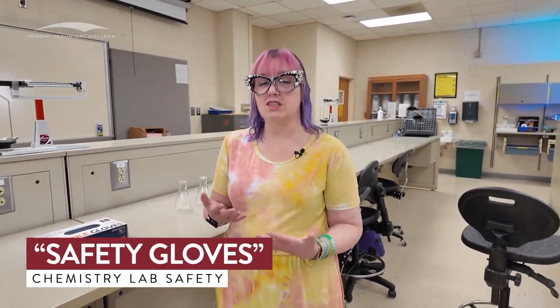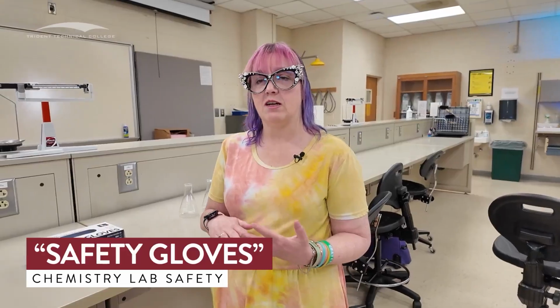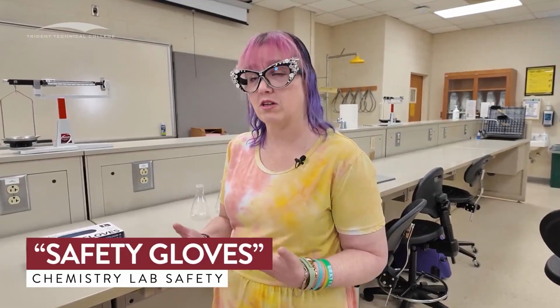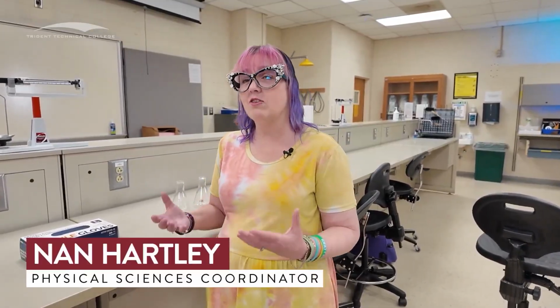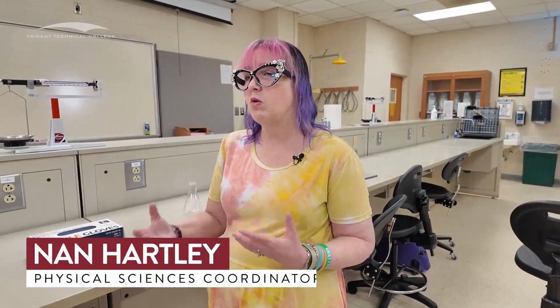We've got a couple of experiments where we specifically need to be worried about our glove protocols. Those experiments are the solution concentration, the titration standardization, and the titration for the vinegar concentration. For those experiments, it's absolutely necessary that we wear gloves for the entire experiment. For the other experiments, gloves are recommended. They're not necessarily necessary. It's never that we don't want you to wear them, but you don't have to wear them for the other experiments.